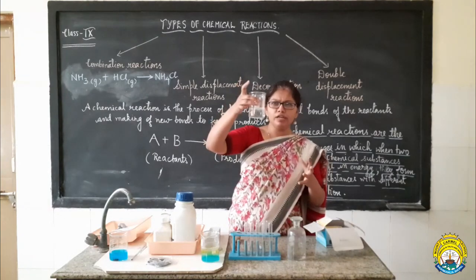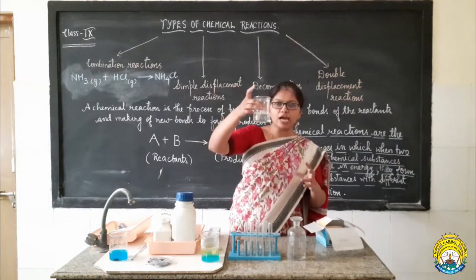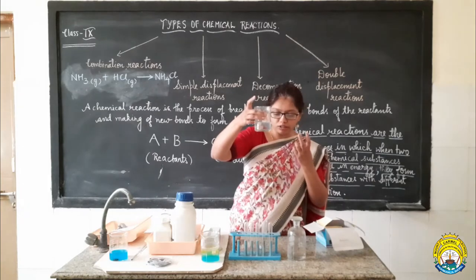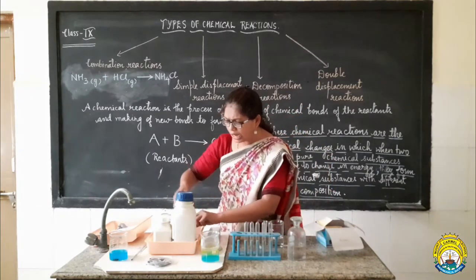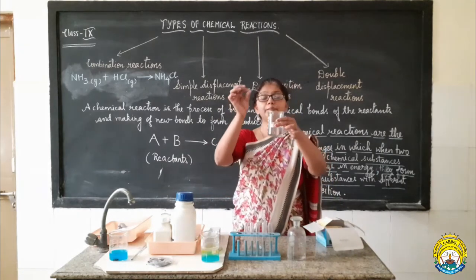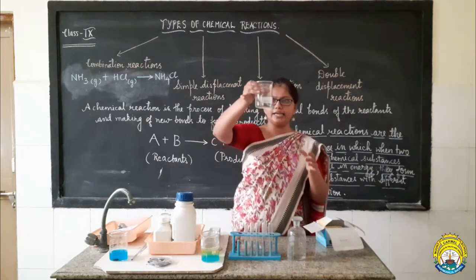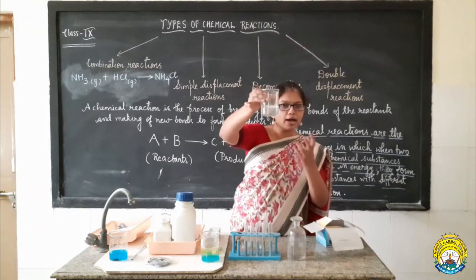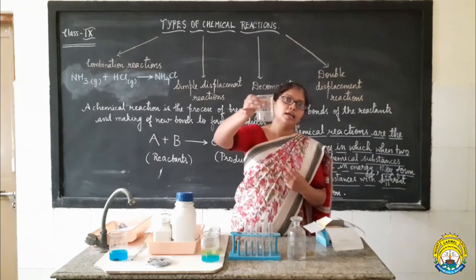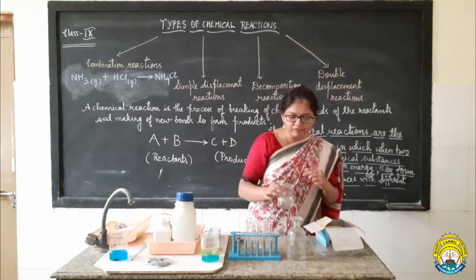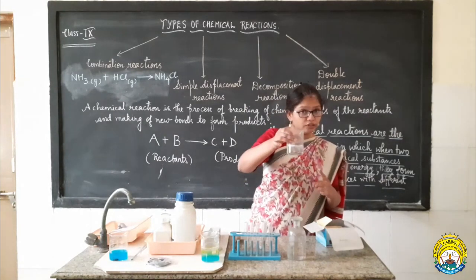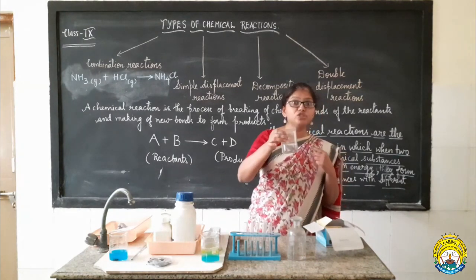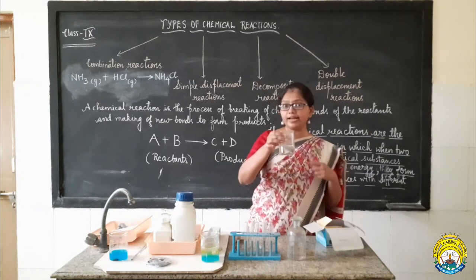Can you see? Some kind of reaction is taking place which actually evolves some kind of gas and it is creating a brisk effervescence — enormous bubbling. Let me show you one more time. I am taking another piece of zinc metal strip and I am going to add it into dilute hydrochloric acid. Can you see this brisk effervescence, enormous bubbling which is taking place here? This brisk effervescence which we are getting here is again observed due to a chemical change, which is taking place because of this chemical reaction between zinc metal strip and hydrochloric acid.